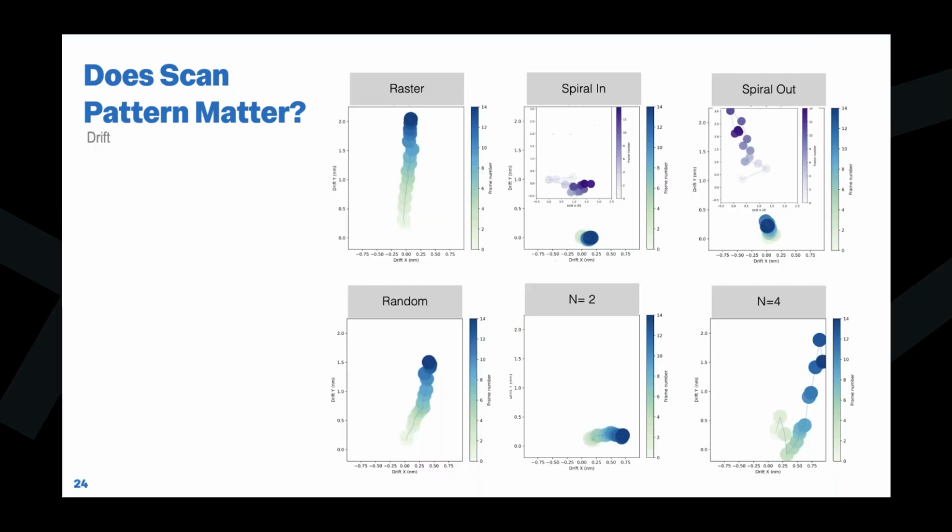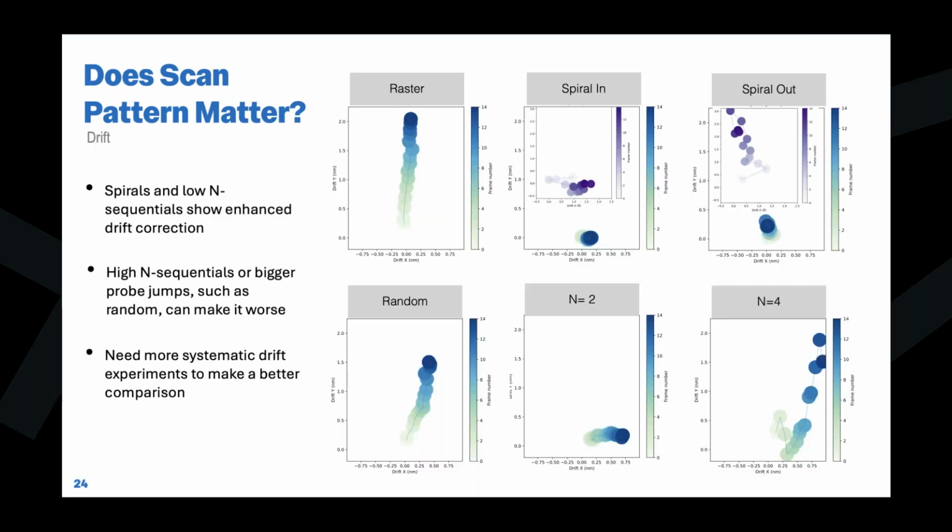So if we go to the next slide. Okay, so because we're testing all these different scans, we care about drift as well.